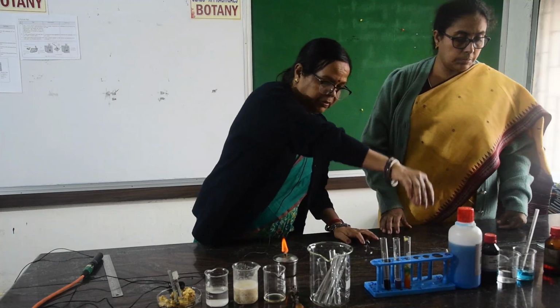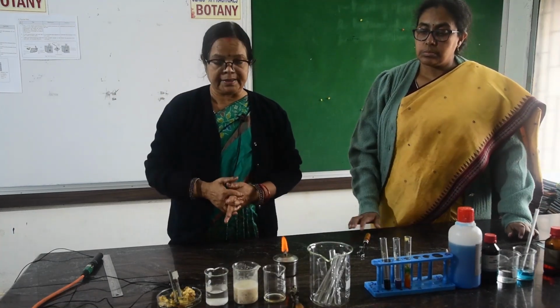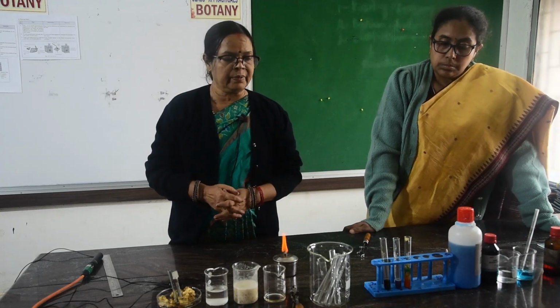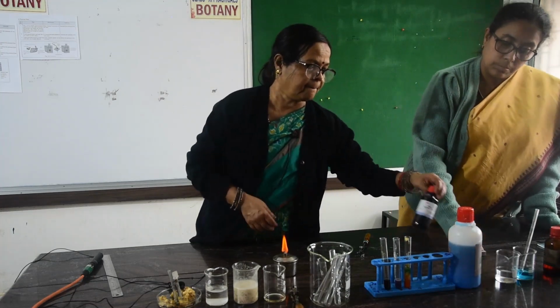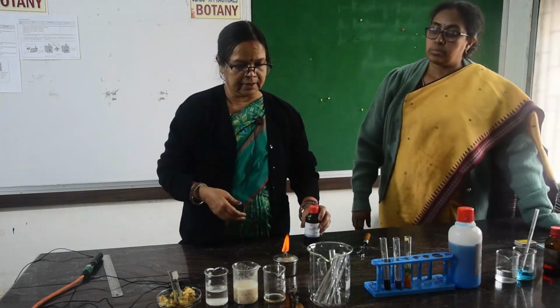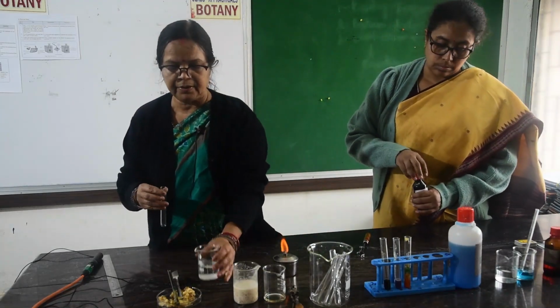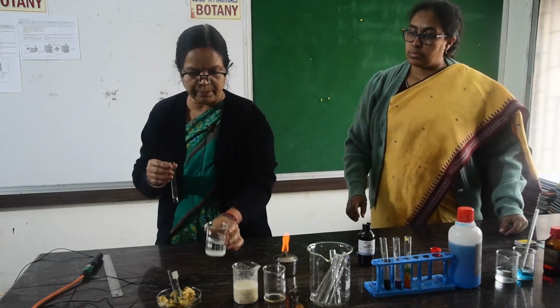Next, you will test for starch. Starch is a polysaccharide, a part of carbohydrate. It will not give a positive test with Benedict's, but gives a test with iodine. This is the iodine solution. You have to take a test tube and add starch solution. Starch is the main plant source.